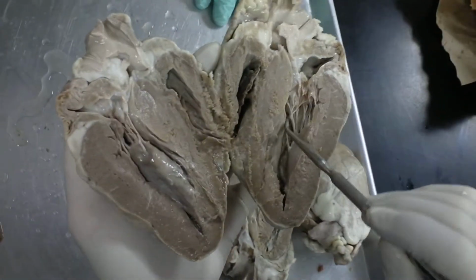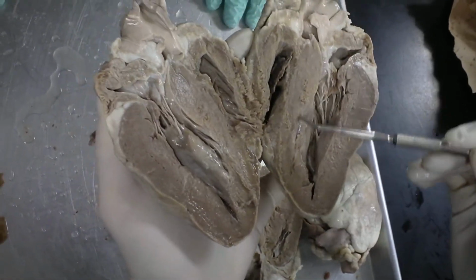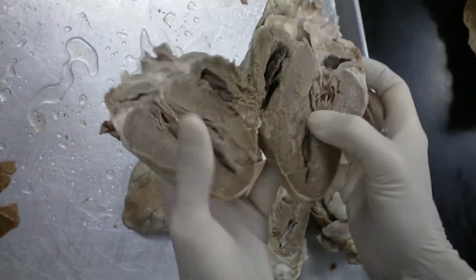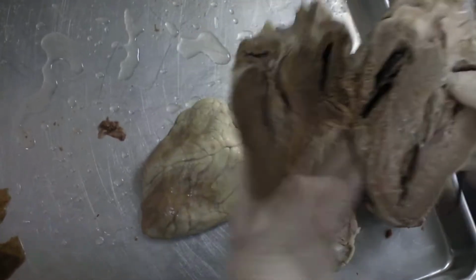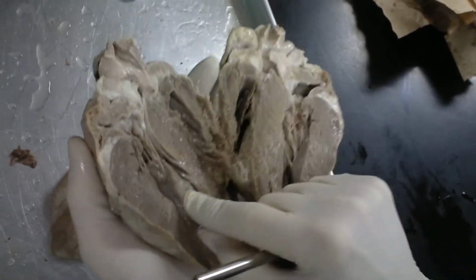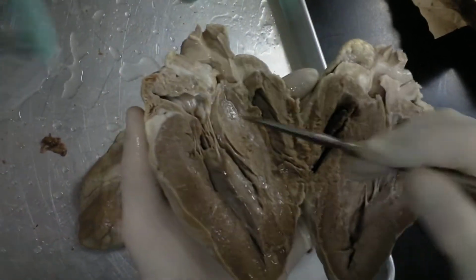Then you have the chordae tendineae, interventricular septum between the right and left ventricle. The other valves, the semilunar valves, are hard to see. This wasn't the heart that has a good one. Papillary muscle, really prominent on this half. This would be again the left atrium because this is the left ventricle.